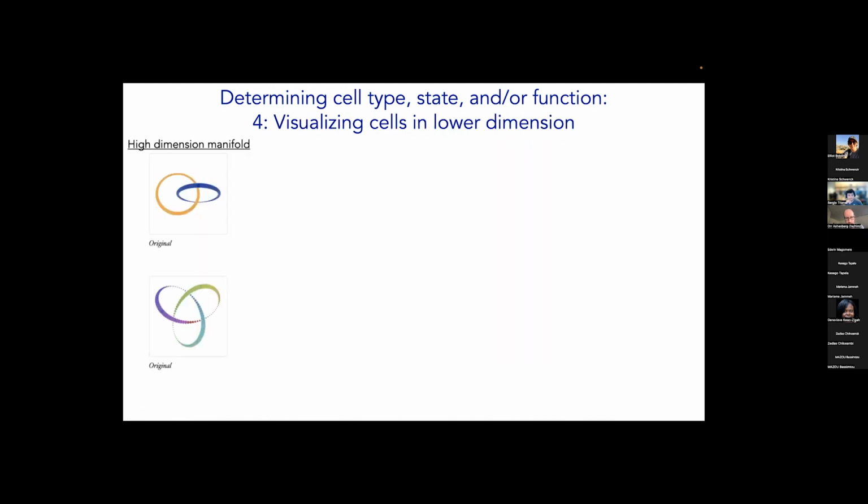Okay, so we've done the differentially expressed genes. The very last thing I'll say before handing it over to Sergio is that often, or almost always, we come up with visualizations for the cells in lower dimensions. Remember, the cells are in 20,000 dimensions, and so we need a way to display them in 2 dimensions that's interpretable to humans.